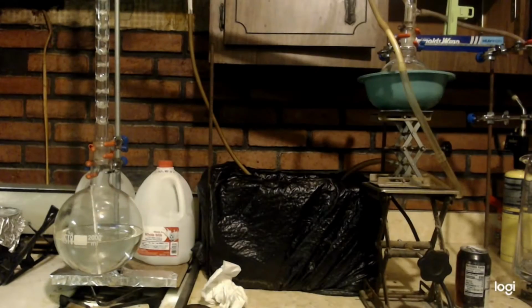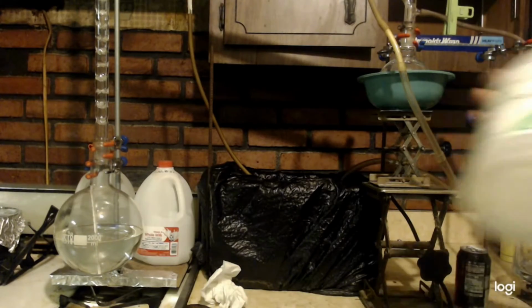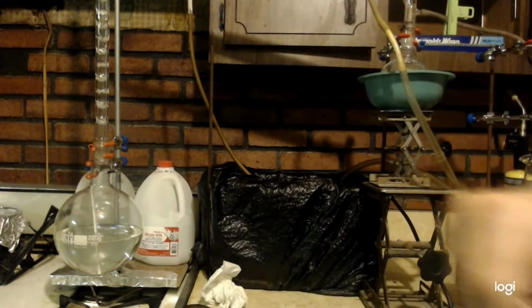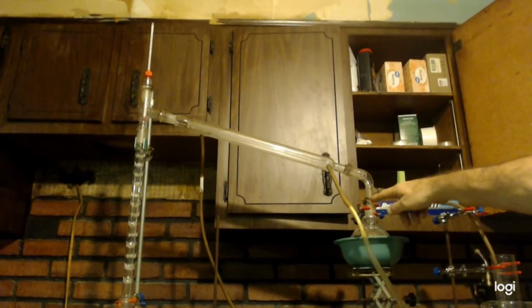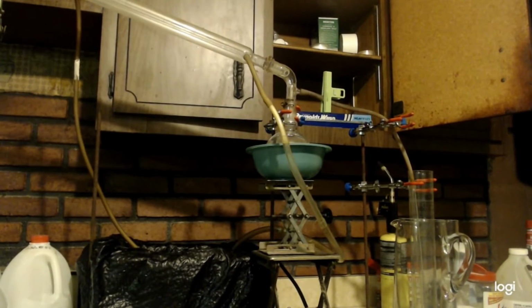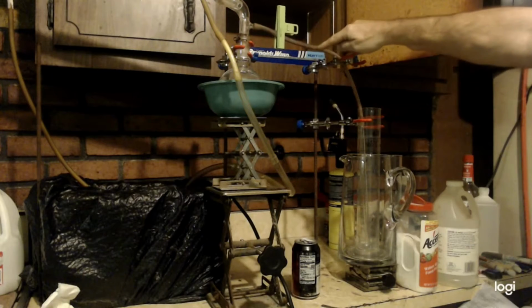So here's my apparatus. I got 1,000 milliliters, give or take, of the clear ammonia water. And I have a Vigreux column on it. And you can see I'm just distilling it. That's all I'm doing. But what I want to do is, instead of distilling it, the gas is going to be driven off. And then it comes down here. Any gas will come out here through this hose.